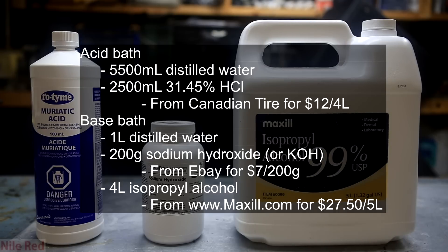For the acid bath I used 5500 milliliters of distilled water and 2500 milliliters of 31.45% hydrochloric acid. For the base bath I used 1 liter of distilled water, 200 grams of sodium hydroxide or potassium hydroxide, and 4 liters of isopropyl alcohol.